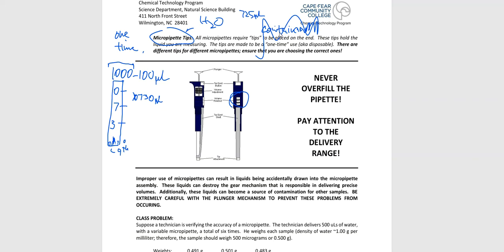That is the only time that this is going to work the way it's going to work. It is due to that 1,000 that is an issue. That 1,000 has too many numbers. They did not give us a dial to go to 4 digits. And they're assuming that that 4th digit is that tick mark every single time.